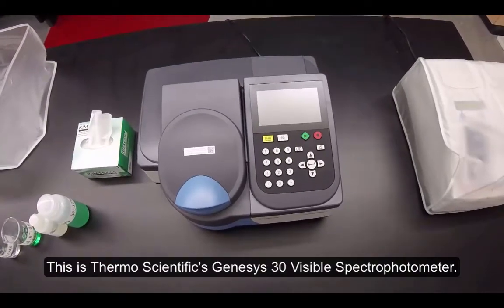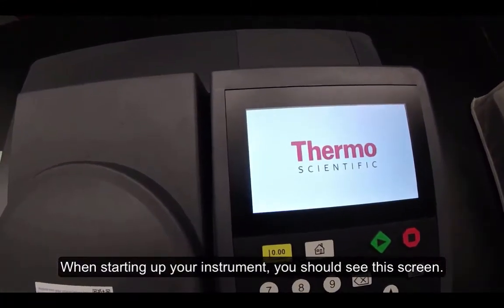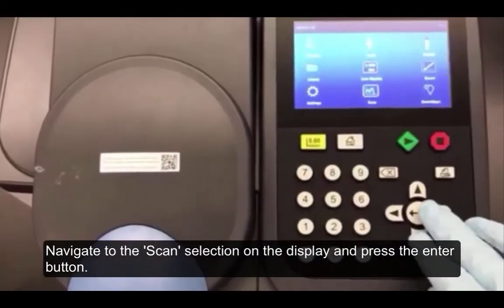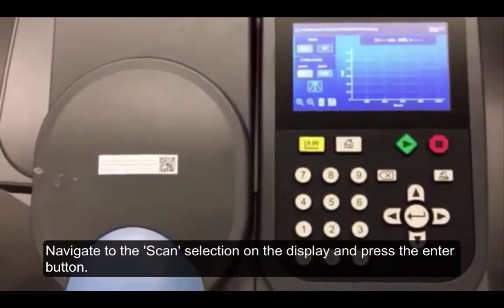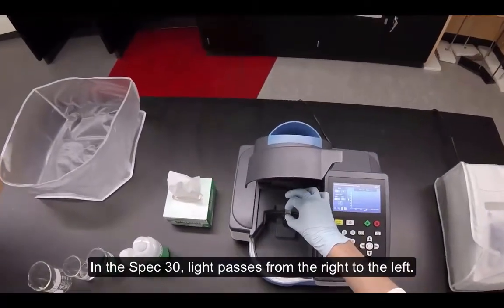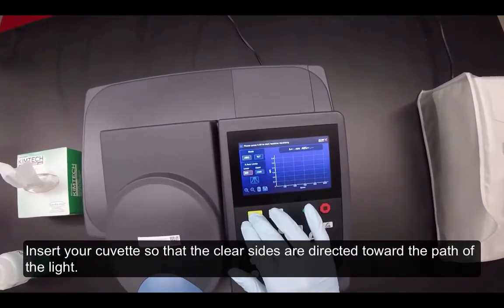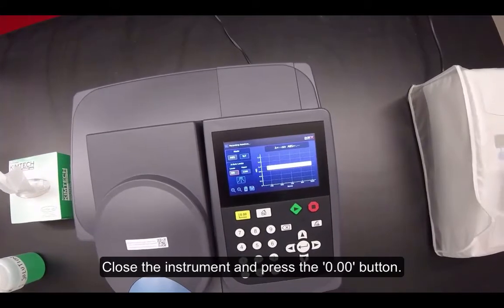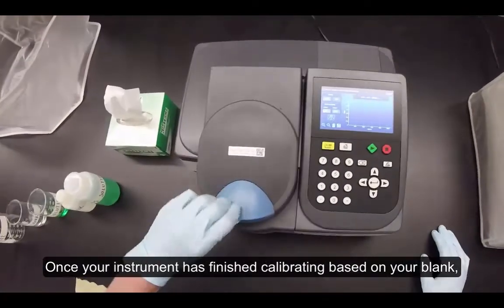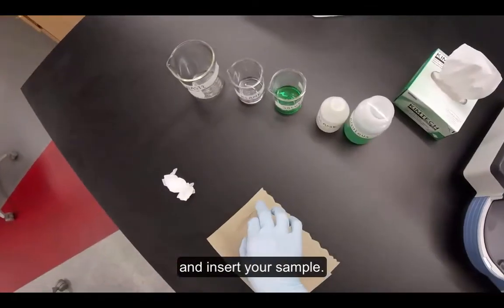This is Thermo Scientific's Genesis 30 visible spectrophotometer. When starting up your instrument, you should see this screen. Allow the instrument to run through its opening preamble. Navigate to the scan selection on the display and press the enter button. Wipe off the outside of your cuvette with a kimwipe. In the Genesis 30, light passes from right to left, so insert your cuvette so that the clear sides are directed towards the path of the light. Close the instrument and press the zero button. Once your instrument has finished calibrating based on your blank, remove your blank gently, place it to the side, and insert your sample.